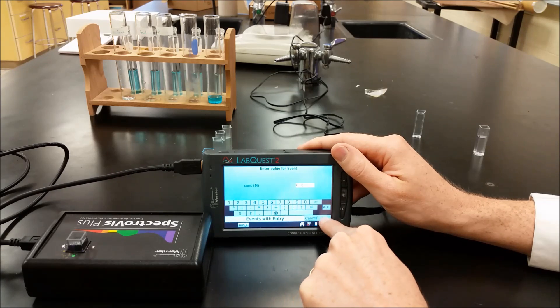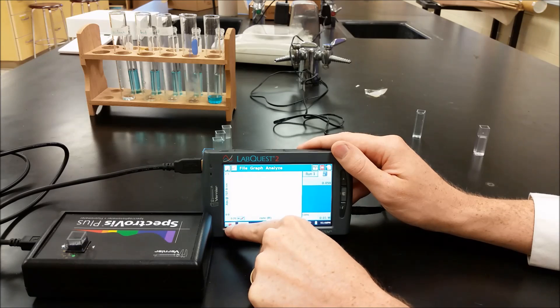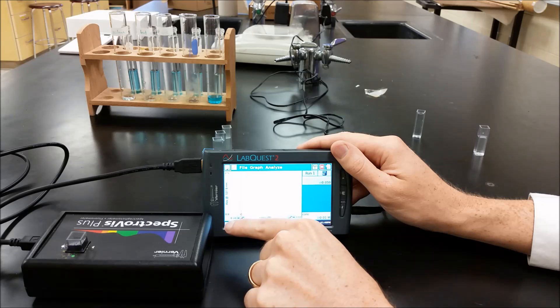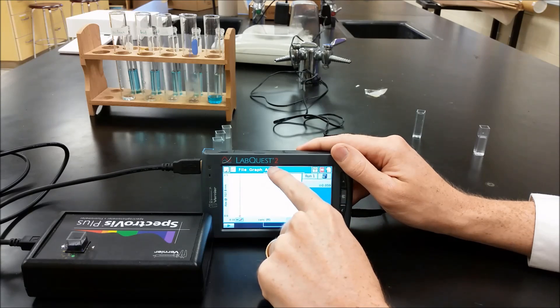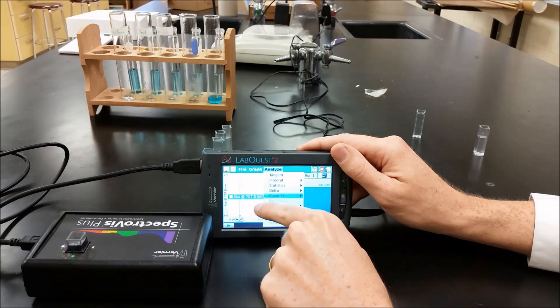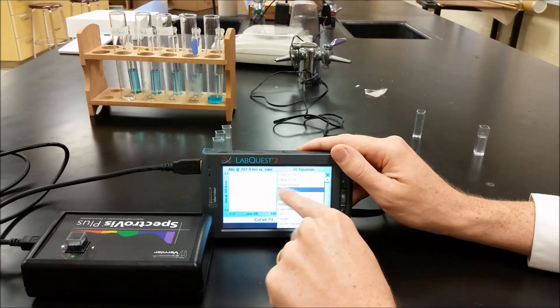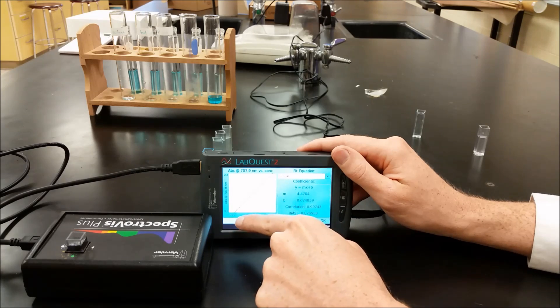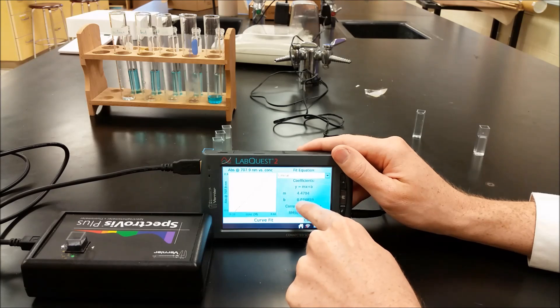And we have our graph. Now when we hit stop, we can then create a line of best fit. Now we can see here that probably might not be a bad idea to get rid of that data point there. But let's go ahead and run it with it. So curve fit. We're going to select our data. And then we're going to do a linear analysis. And that looks like a decent fit there. It looks like we really could do without the 0.5. And we'll probably get a little bit greater slope. But nothing terrible there.